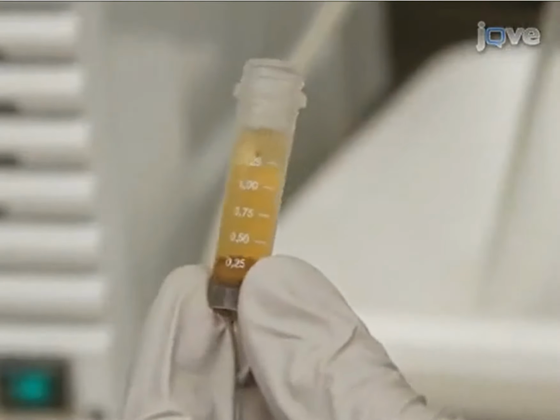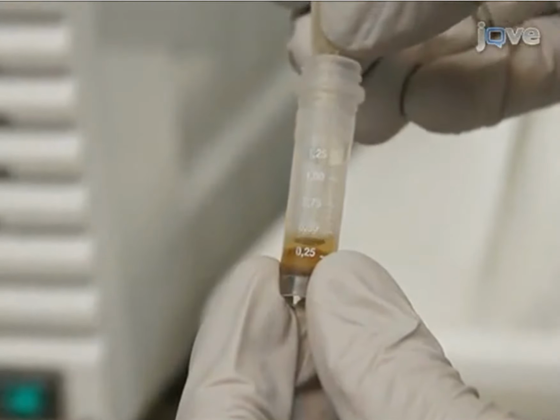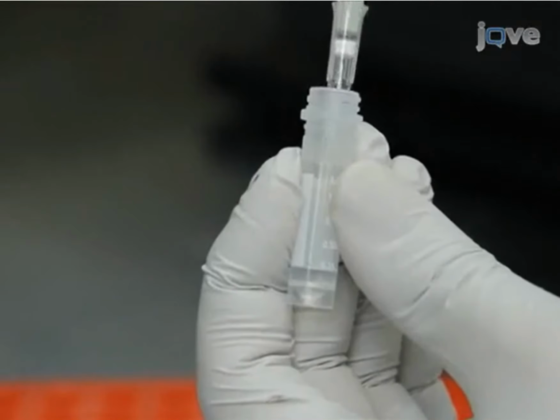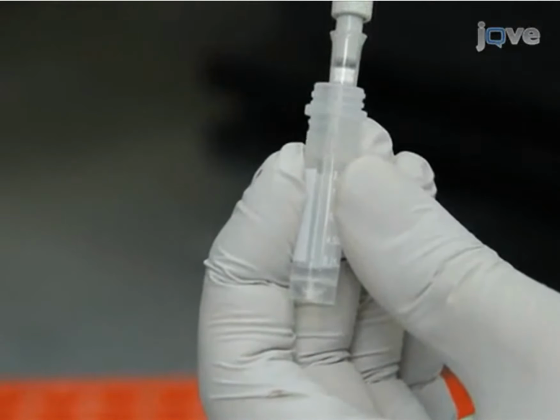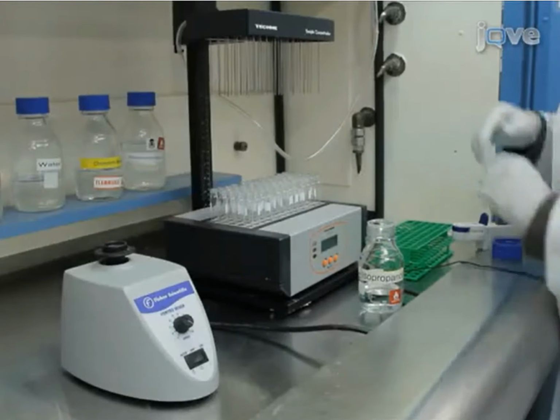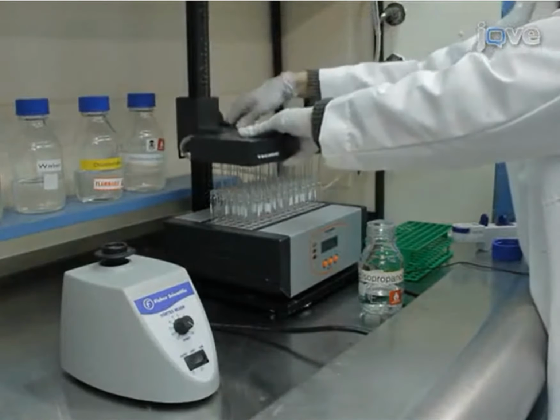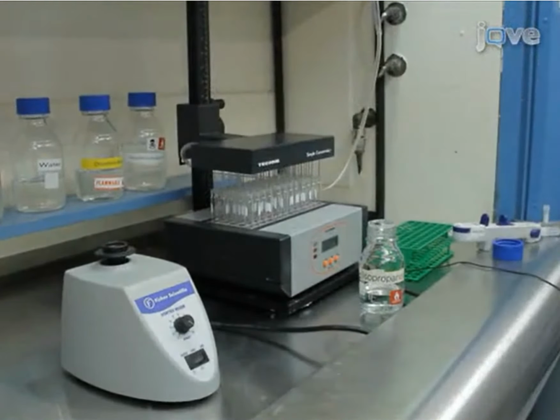The starting material for determining the crystalline cellulose content can be isolated cell wall material or wall material already treated with the weak acid TFA, either immediately after acid treatment or in a storable dried form after removing excess TFA with isopropanol, as shown previously.